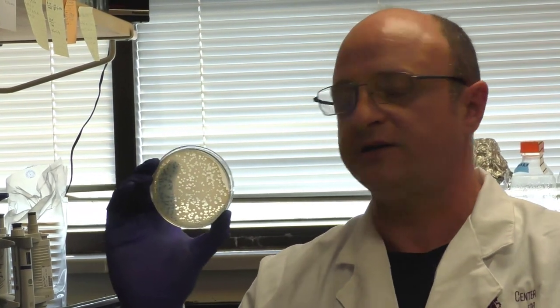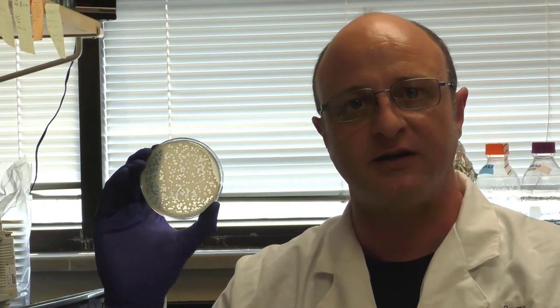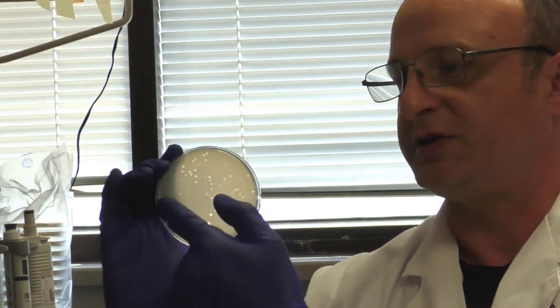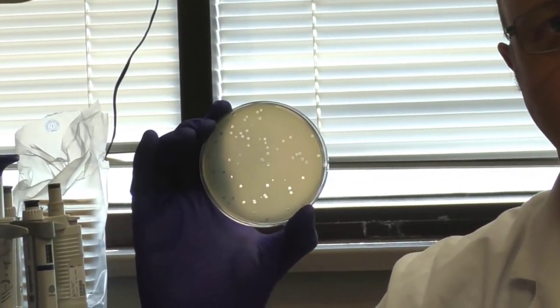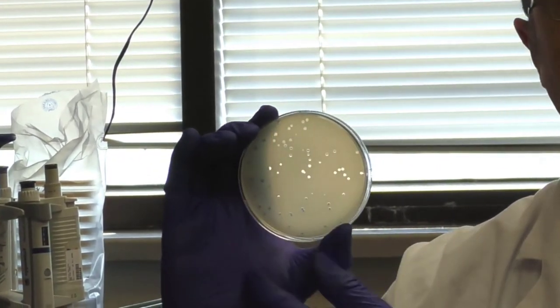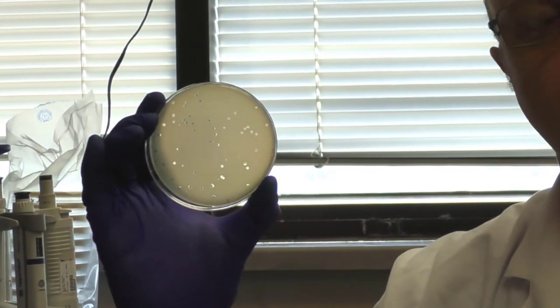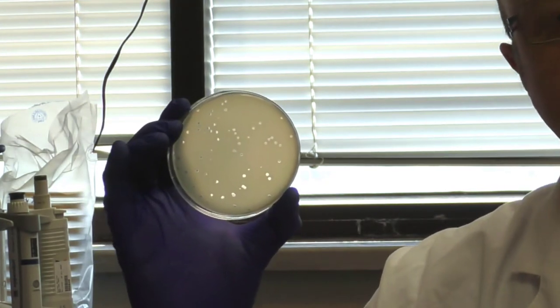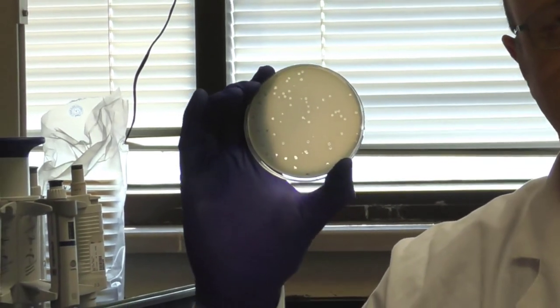As we get down to the 10 to the minus 5 dilution, now we're starting to get to separate plaques. But if you notice, a lot of them are running together. There's too many plaques on this plate to be counted in a statistically meaningful way because too many plaques are running together. So this would be labeled as TNTC, too numerous to count. Then our next plate is our Goldilocks plate. This is the 10 to the minus 6 dilution. And as you can see, you have nice separated plaques all over the plate. And we have a number greater than 30 plaques to count, less than 300, which is typically the numbers that we use. Less than 30 is too few, and over 300 is too numerous to count. This is the plate that we would use to extract our data.